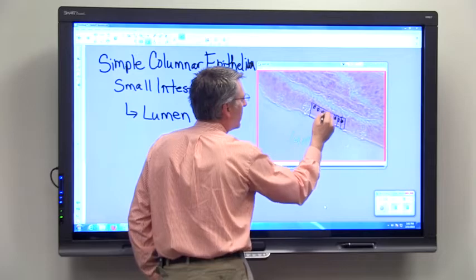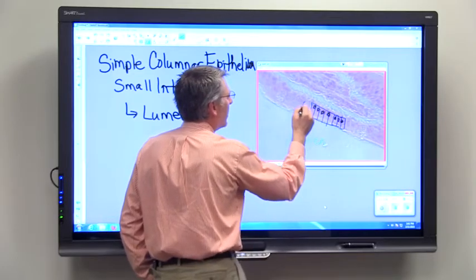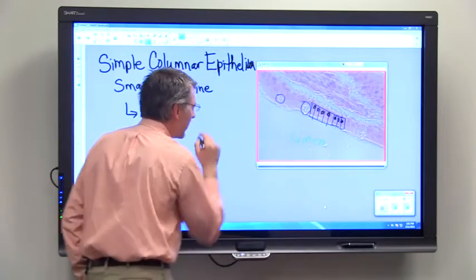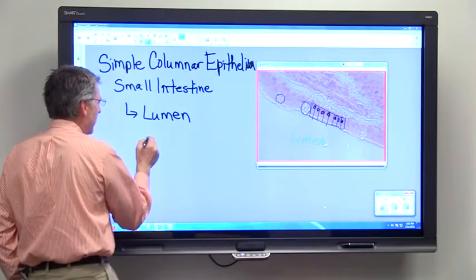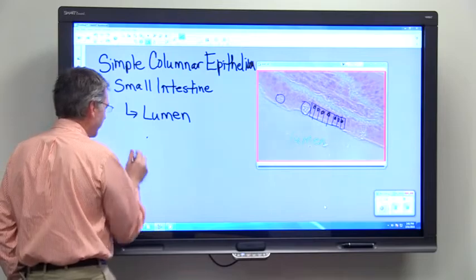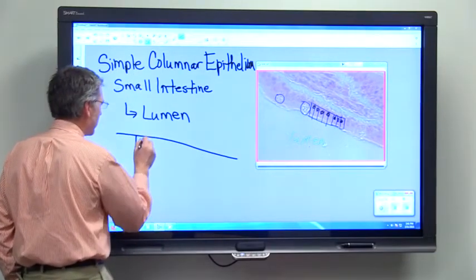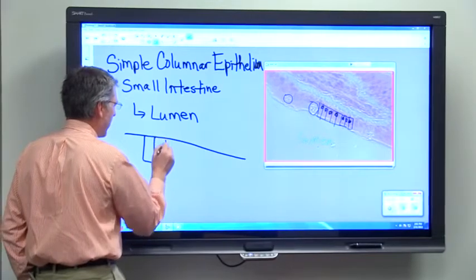We could separate these cells sort of like this. Here's a goblet cell that we looked at, and here's another goblet cell. So if we wanted to draw that tissue, it would look something like this, which is pretty much what we have over there.